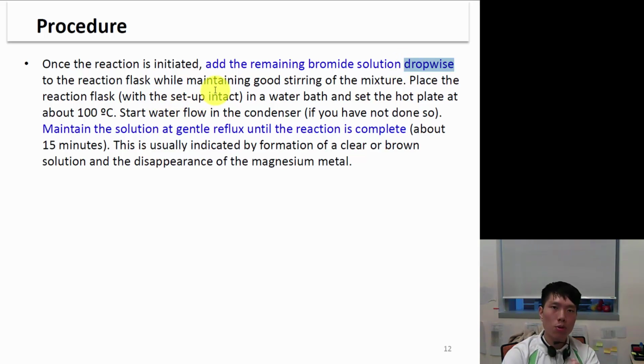And also we want it to have even stirring and make sure that every drop goes in, it reacts away with the magnesium. We don't want to waste anything. Get a high yield, get a high purity.